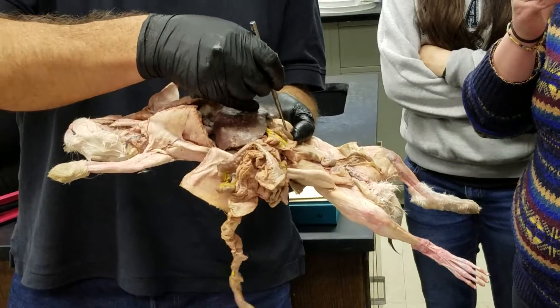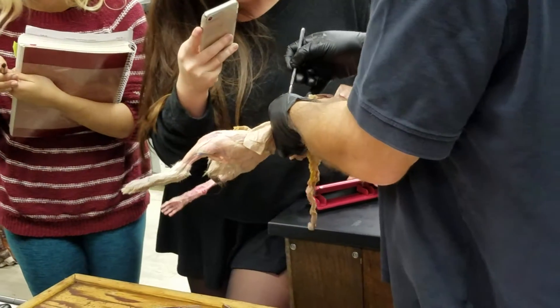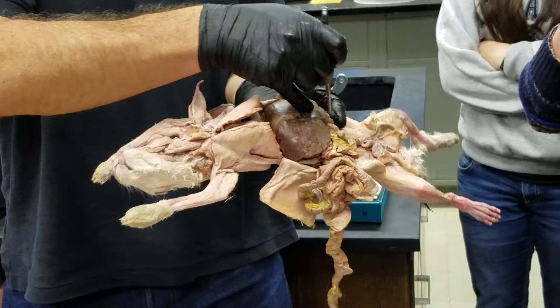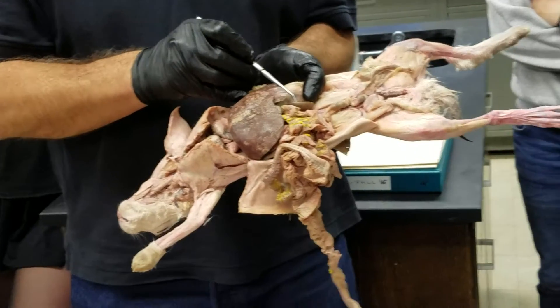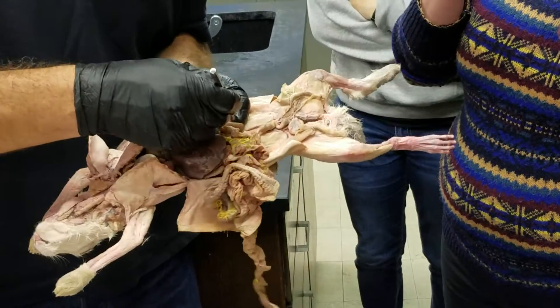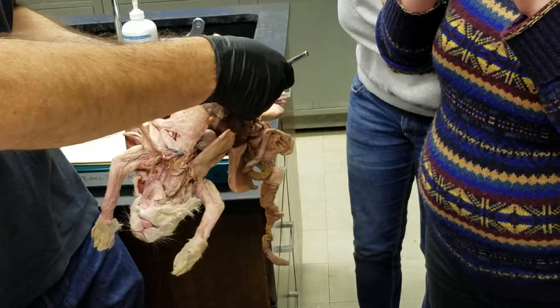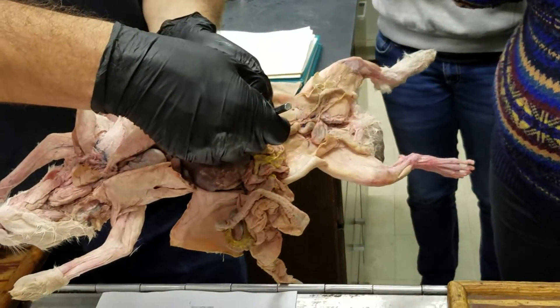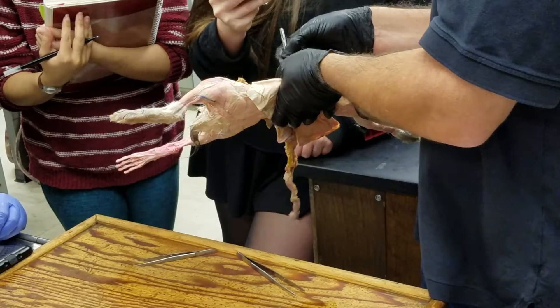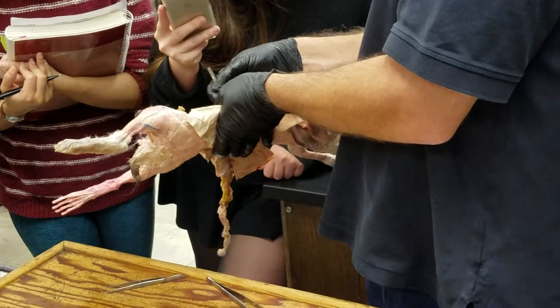If we cut the kidney open, there's a dark central core — that would be the medulla. Then there's an outer lighter area — that would be the cortex. Following down to the inside of the medulla, there's a little point that sticks out from the medulla into a space — and that point is called the renal papilla.